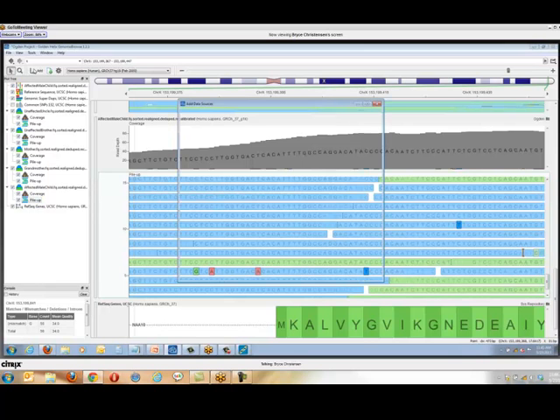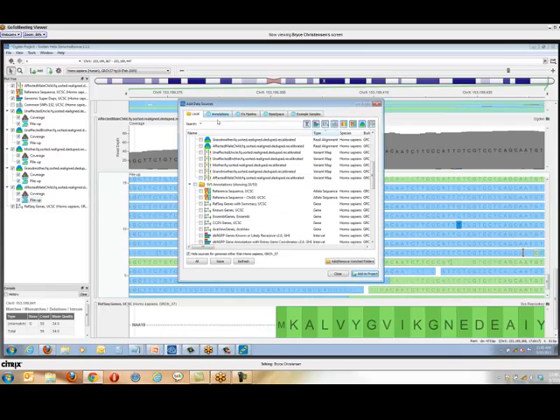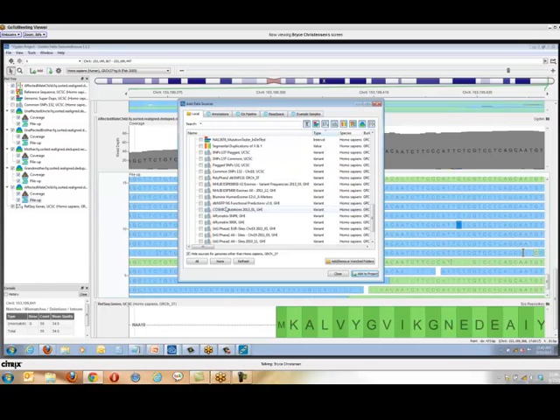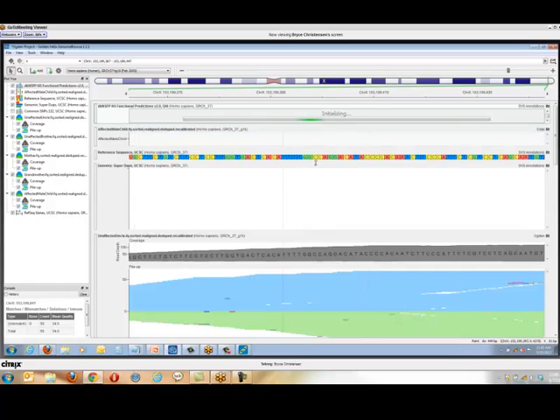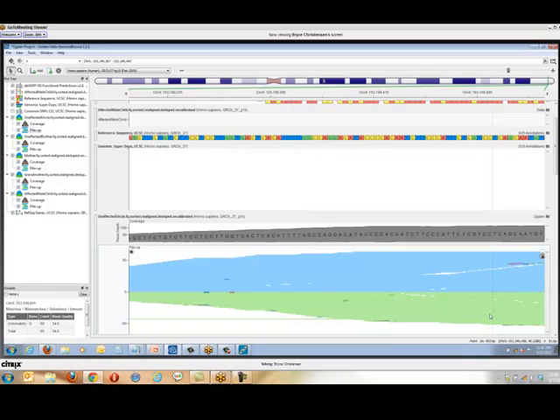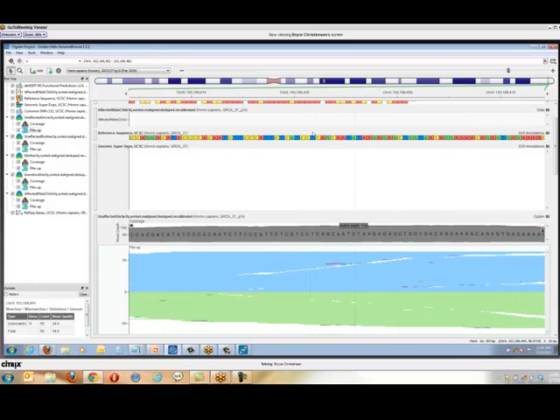So let's add that in, and I'll show you how that was done. I have this down at the bottom: dbNSFP functional prediction scores. That exists as an annotation track that is curated to show available functional predictions at every possible non-synonymous variant according to Ensembl.